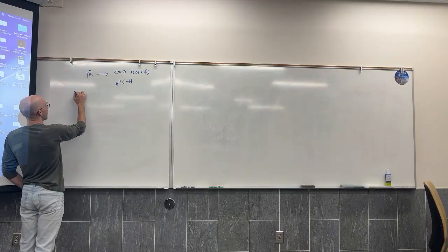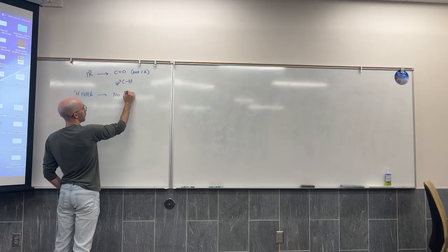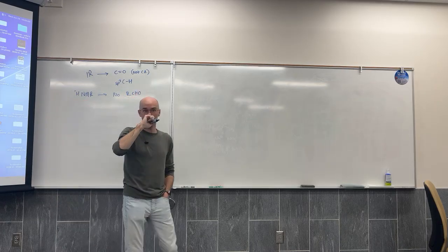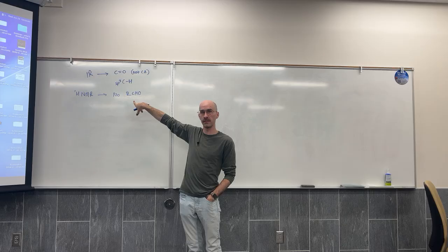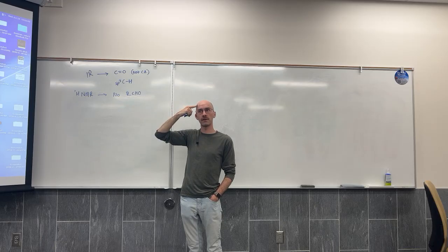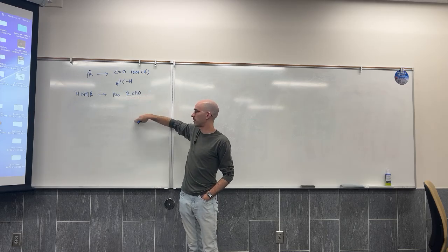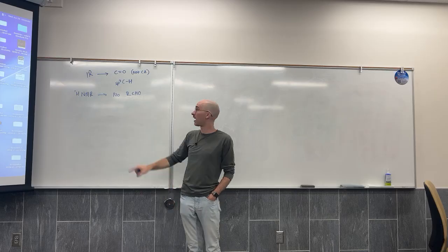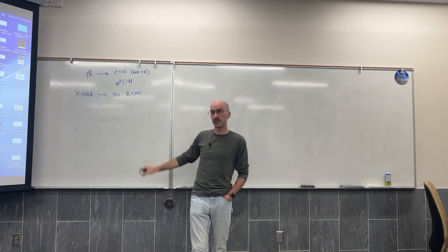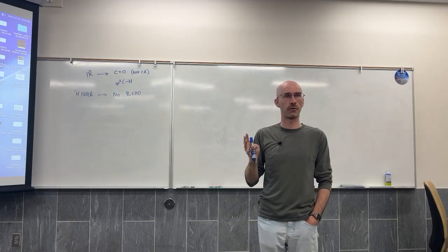We looked at the proton NMR, and we felt confident that there is no aldehyde. You guys remember that this is the abbreviation for aldehyde, right? Not trying to trick you, trying to expose you to all the different ways that we can abbreviate these things. I once looked at an MCAT study guide question, and it said, in the structure, and then it showed this, and it was like, what is this meaning? And I was like, I had never even seen it presented that way. So I want you guys to see all of the different ways it can be presented.